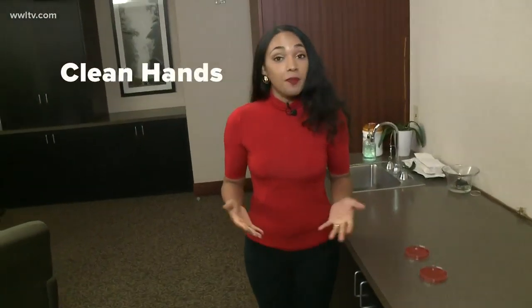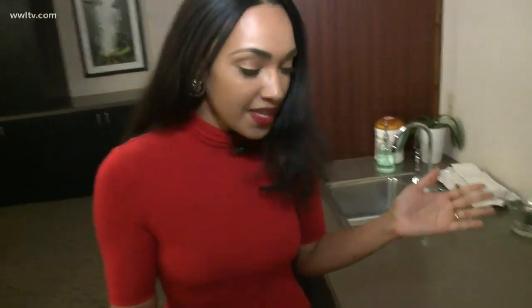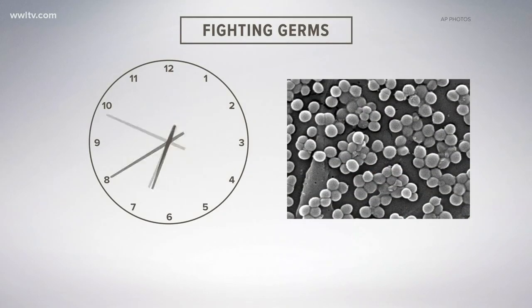Now we're going to try the experiment with my hands clean — this one washed with soap and water and the other cleaned with hand sanitizer. We're going to do the same thing: press them into the petri dishes and see how much bacteria grows.